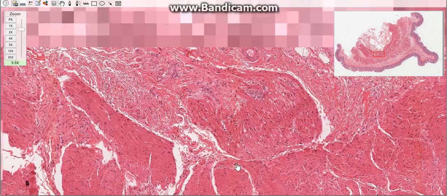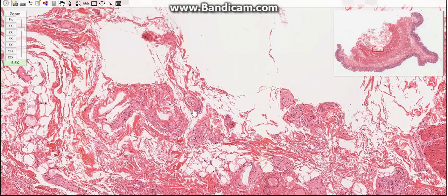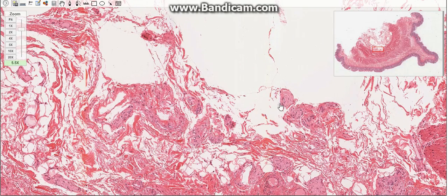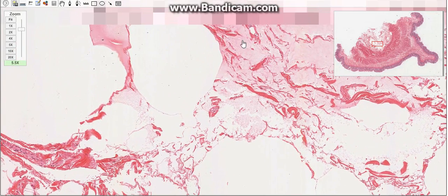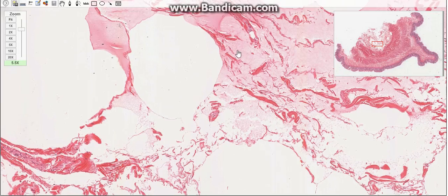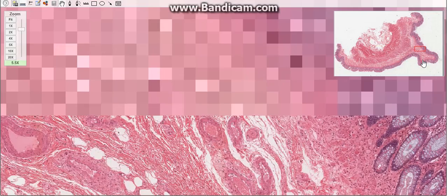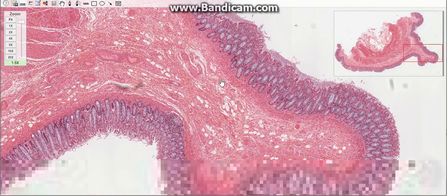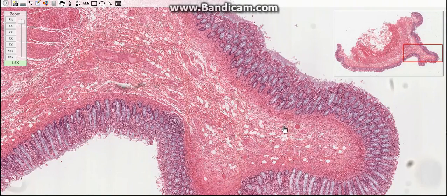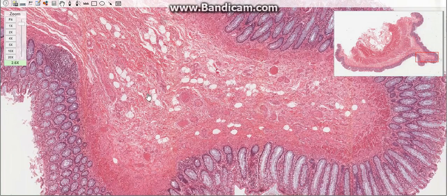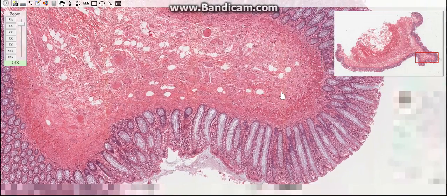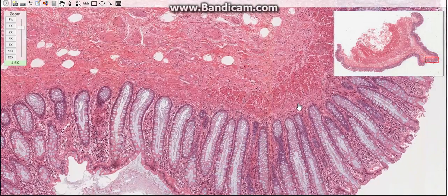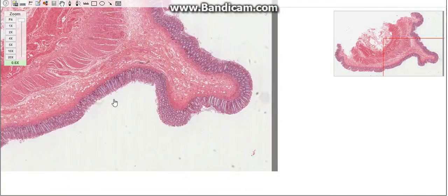The last layer is the serosa, which consists of mesothelium with a thin layer of underlying connective tissue. It is characterized by small protuberances of fat deposition called the appendices epiploicae. The appendix is an evagination characterized by a small, narrow lumen caused by the presence of an abundance of lymphoid follicles in its walls. The general structure of the appendix is similar to that of the large intestine.